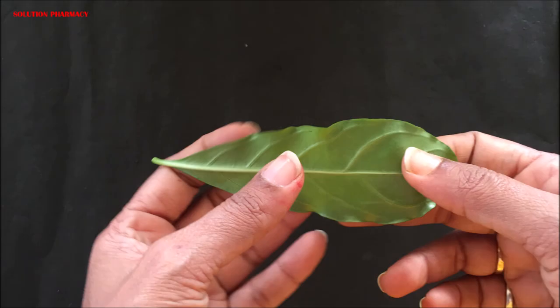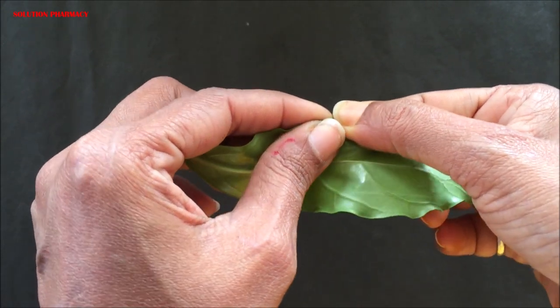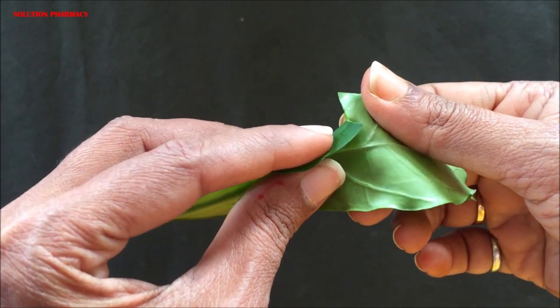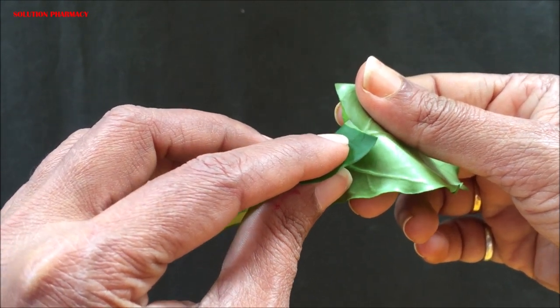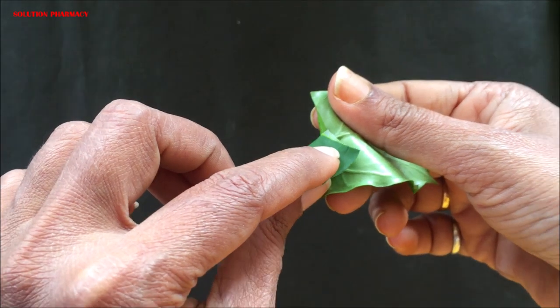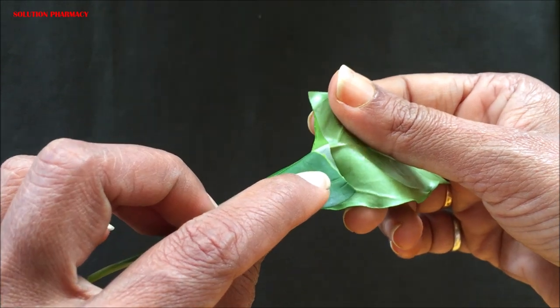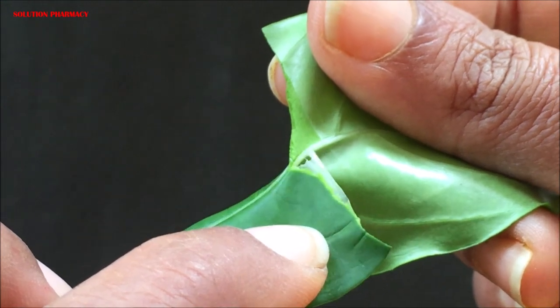First, we have to separate — peel out — a small part of the epidermal layer from the leaf surface. This part is called the epidermal peel, in which stomata are present. To do this, tear the leaf from the margin, fold the torn portion, then pull the folded portion in the opposite direction of the venation carefully to separate the epidermal layer. You can see the thin transparent layer in the video — this is the epidermal layer containing the stomata.